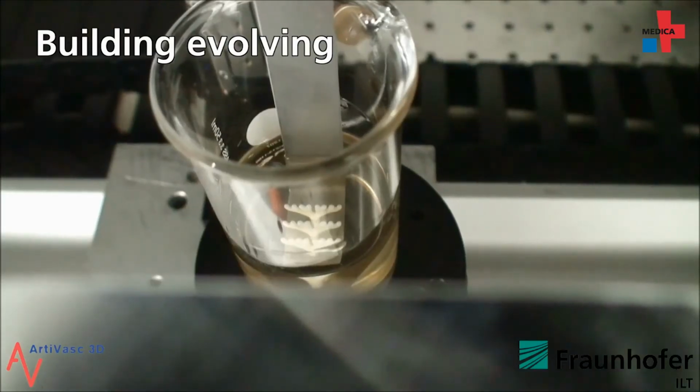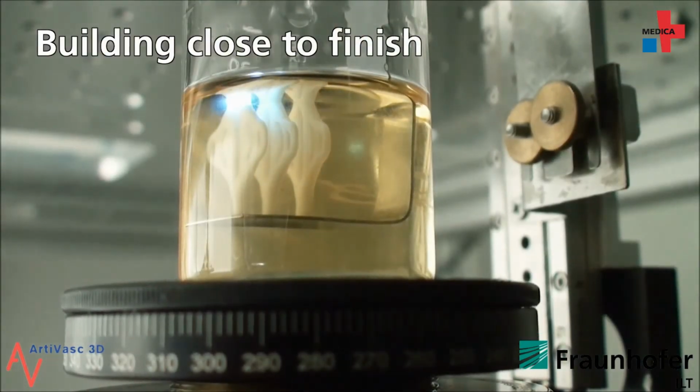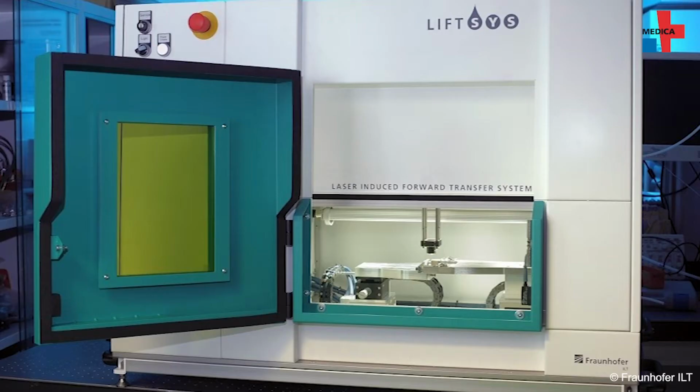These cells are processed in bioprinting using 3D printing. Two different methods are used at the Fraunhofer ILT in Aachen, Germany: the LIFT process and the stereolithographic process. We developed mainly two different processes. One is the laser-induced forward transfer process, which is a printing process to directly print single cells or clusters of cells. And the other process is stereolithography.